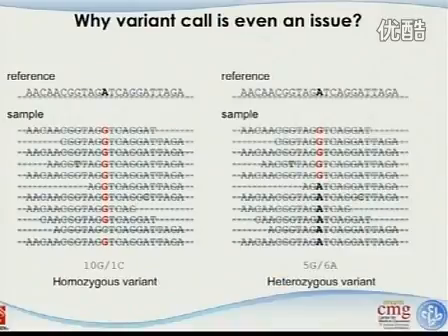And sometimes we see this. Okay? If location 5 is G and 6 is A, that is very likely a heterozygous variant compared to the reference genome, right? Half of them are from mom, half of them are from dad. I don't know which one is from which, but this type of thing makes sense. So this is a heterozygous variant, and that is a homozygous variant.